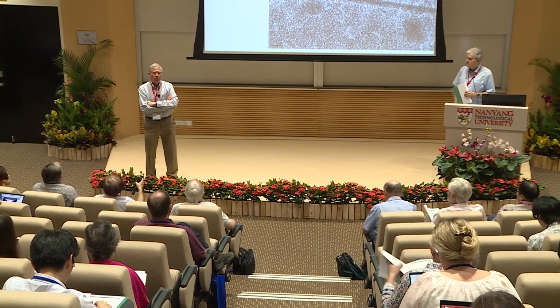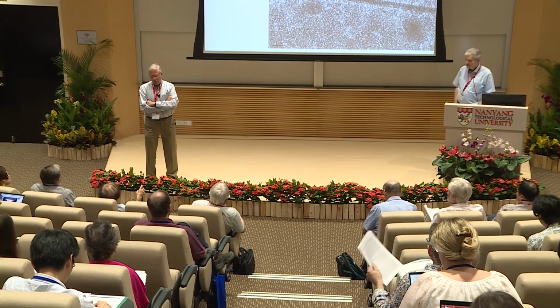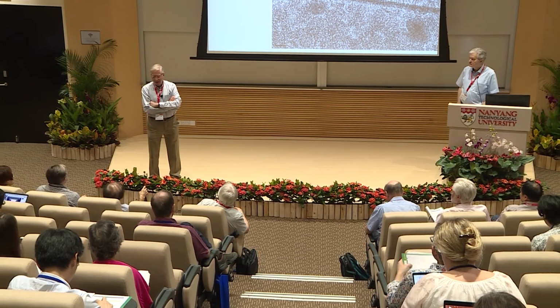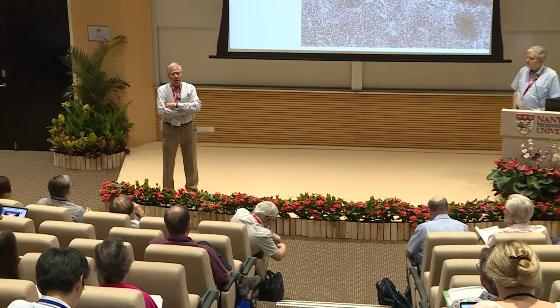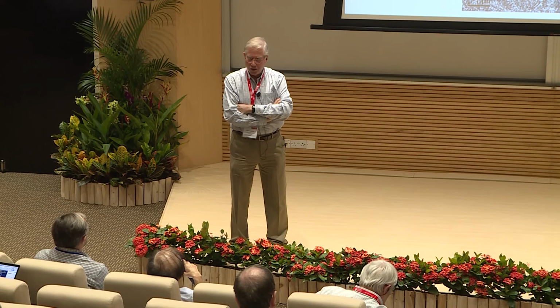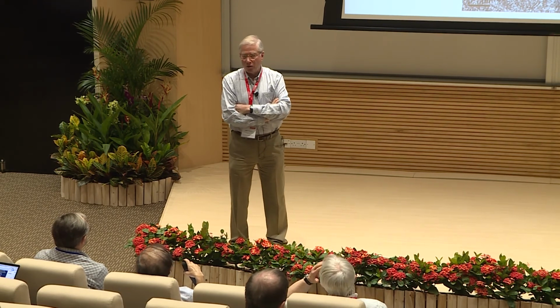Okay. Quite often we are interested in the evolution of a structure. I must admit that in these systems that I showed today, we haven't really gone into the time history of this. We were more interested to see what actually happens after a relatively long time.